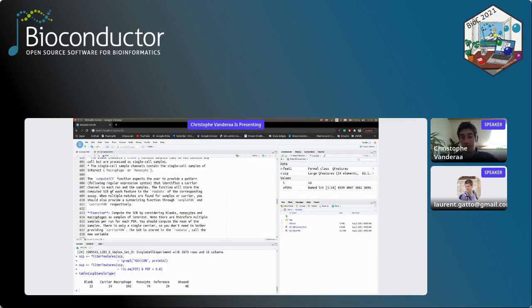So now I'll let you work a little bit. I'll go through the hints successively, but I want you now to compute the sample to carrier ratio, which is a very informative QC metric for PSMs, just as a reminder. I'll let you work. Maybe I'll be speaking, but you're not obliged to listen to me.